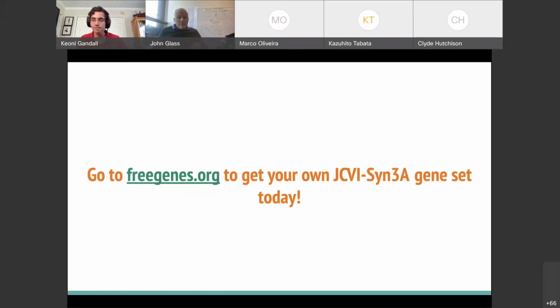Keoni, this is James Dobbins back at UAB. Are the M. genitalium and M. pneumoniae genes a work in progress, or is that as far as they're always going to go? They're probably as far as we'll go, mainly because when we were originally cloning them, we were cloning them by hand, or rather on our own robots, and so the price was a lot cheaper.